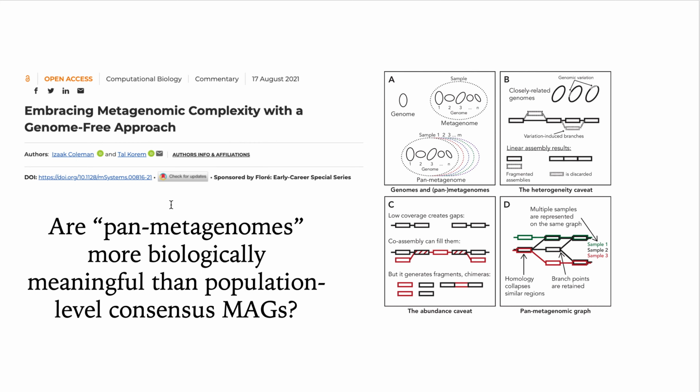I think it's a really interesting concept, and I think it's going to be a really important concept as we continue to explore and define microbial diversity in the environment. But there's no program or algorithm yet that is getting us there. And so right now it's more of a thought exercise, a theoretical concept. But I encourage you to think about this when you're binning your MAGs and make sure not to misrepresent the product of those analyses. So with that, I will end this tutorial.